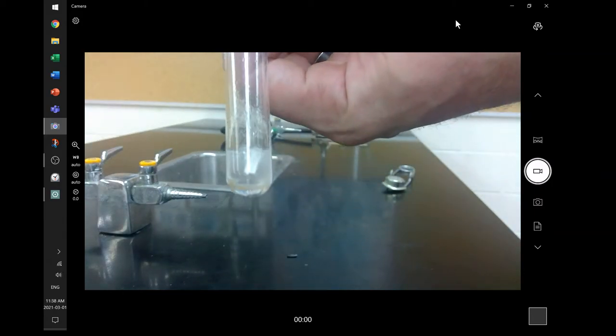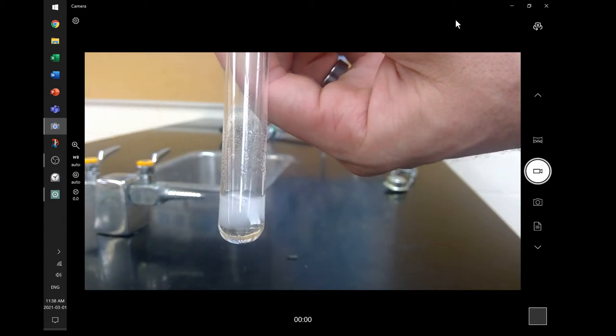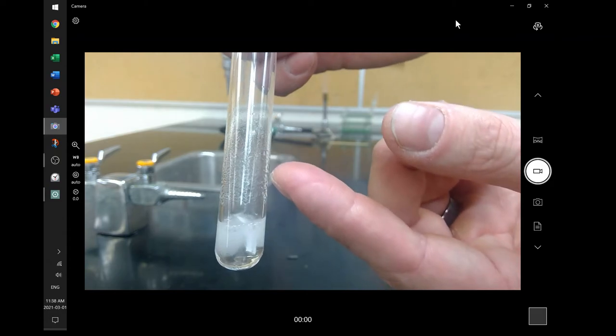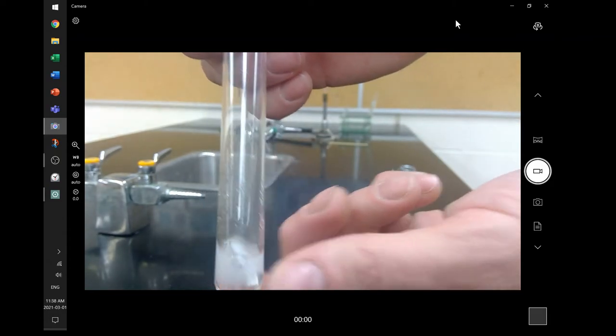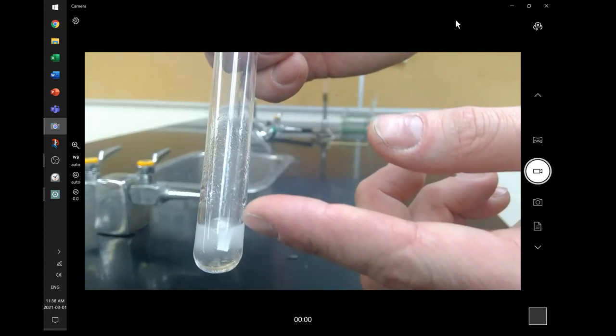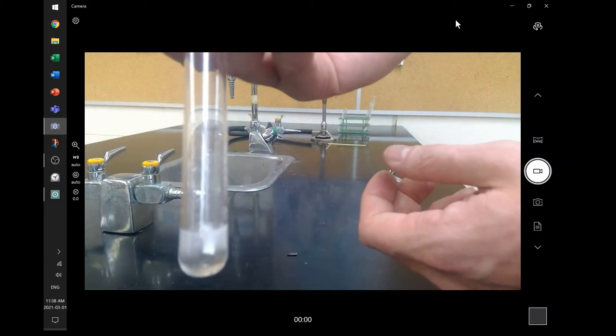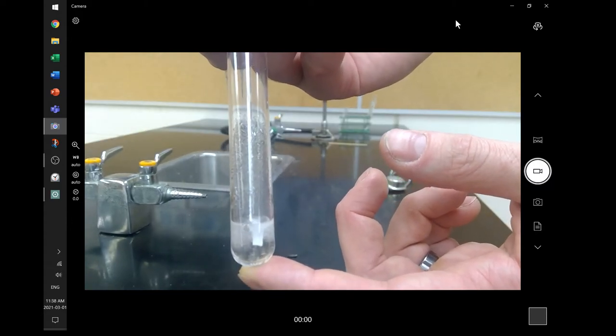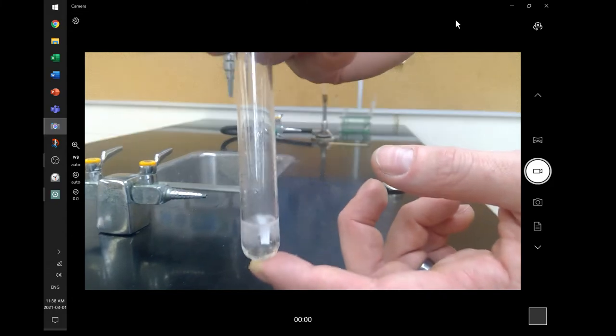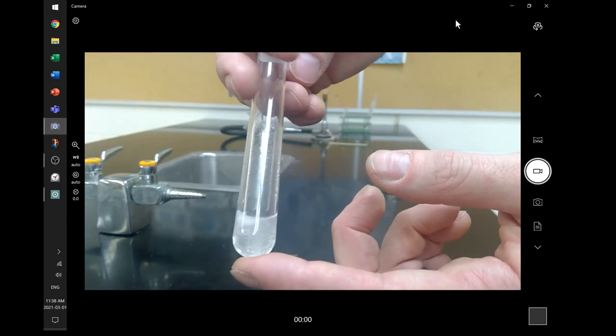I don't know if you can hear it. You can potentially see some of the changes. Maybe you see something being produced up inside the glass, not only on the surface of the glass itself, but something that's rising out of the bubbles. And you're going to think to yourself, what is it that's going to rise and fill a space, fill a container? And moreover, just notice the bubbles. We're going to look at chemical changes and chemical indicators of chemical changes. But maybe there's some things that we're worth chatting about.